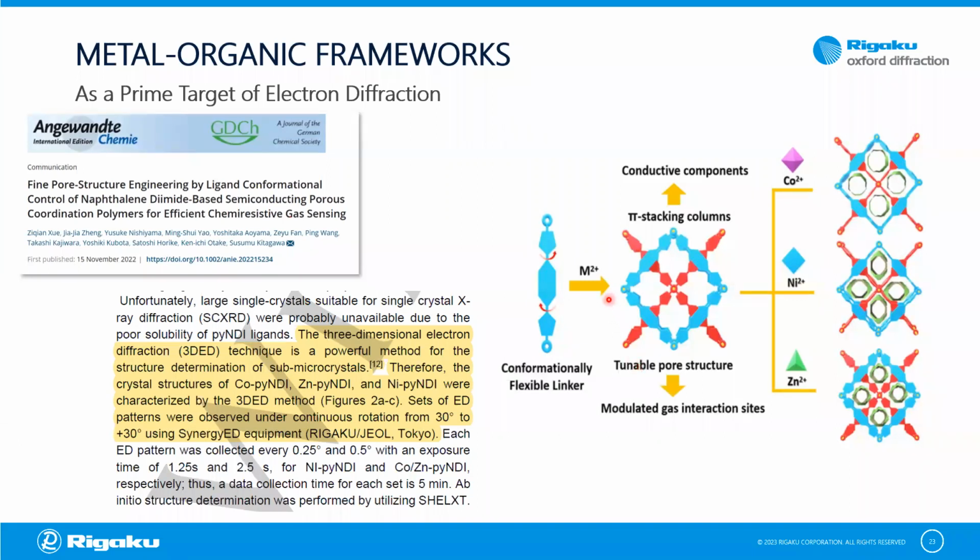At the same time, the metal organic framework changed the pi stacking interactions and subsequently its conductive properties. These structures have not been available before with other techniques, and they represent a huge interest group in Synergy-ED. About one third of the samples in our lab are nowadays metal organic frameworks.